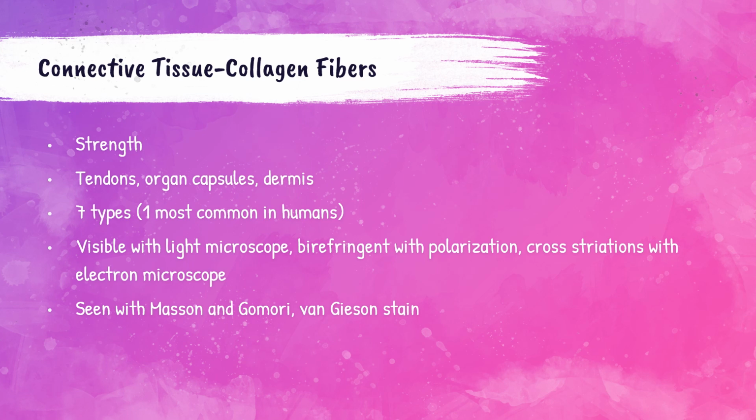In the histopathology laboratory, collagen fibers are demonstrated with the Masson and Gomori technique and with the Van Gieson stain. All of these stains will be discussed later on within this lecture, so don't worry if you don't know what they are now.